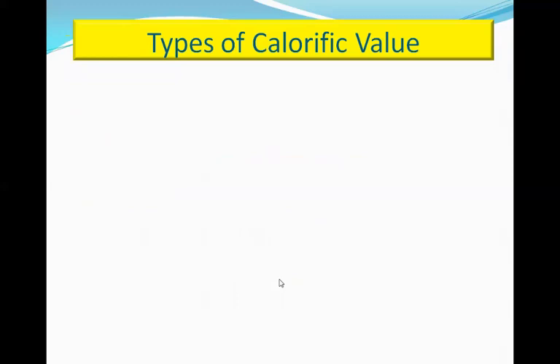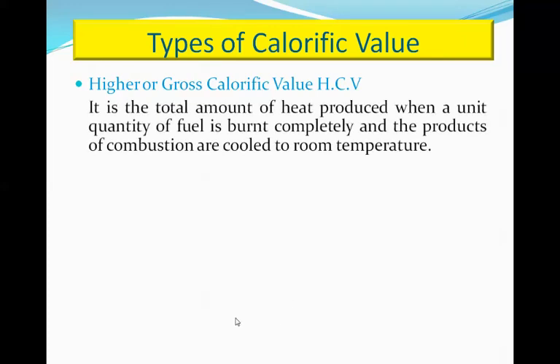Now the calorific value itself is of two types: higher calorific value and lower calorific value. As the name indicates, higher calorific value refers to a higher value. It is the amount of heat produced when a unit quantity of fuel is burnt completely and the products of combustion are cooled to room temperature.